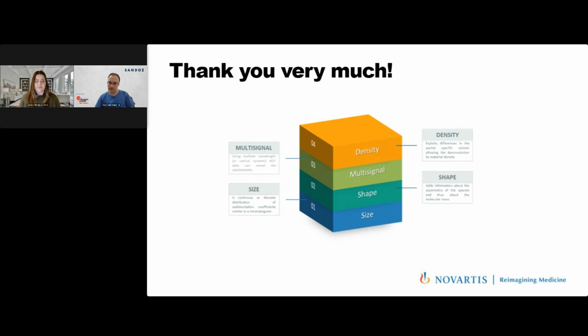Great, thank you. Our next question asks, is Ultrascan available to be purchased? I think so, yeah. We have purchased a system called Ultrascan in a Box, where you have your own in-house server, and it allows you to store your data not in the cloud, so to say, but locally. And if you're interested in pricing, you may contact Boris Demler directly, but it's commercially available.